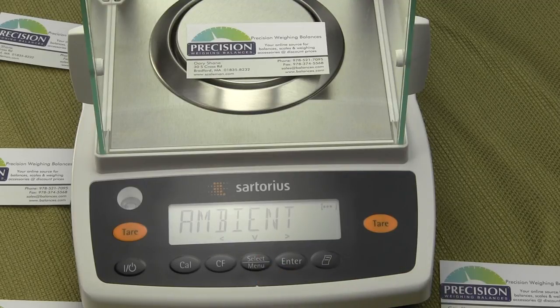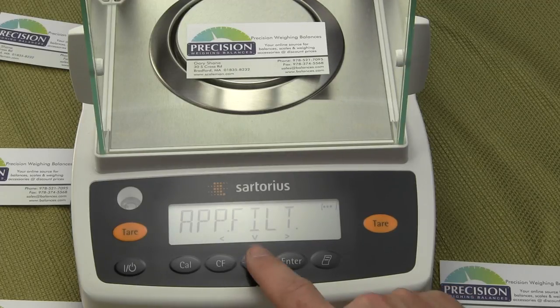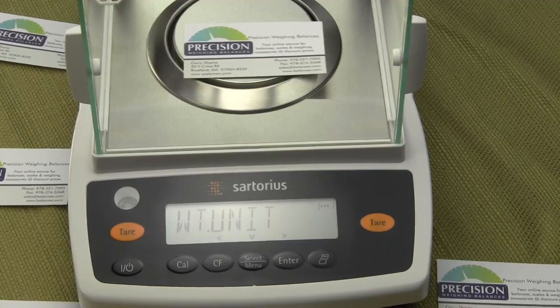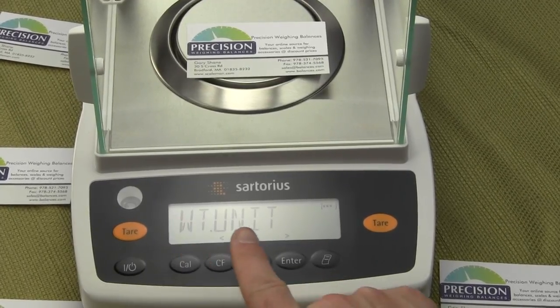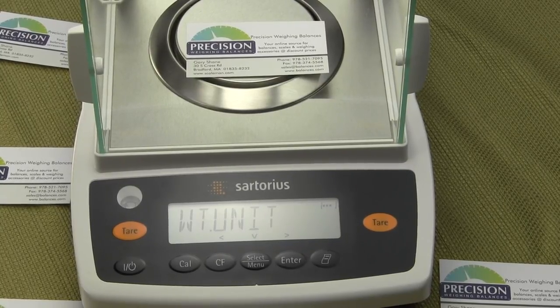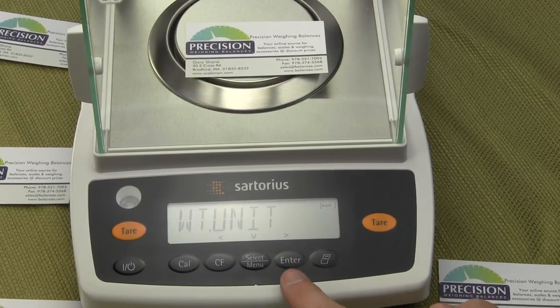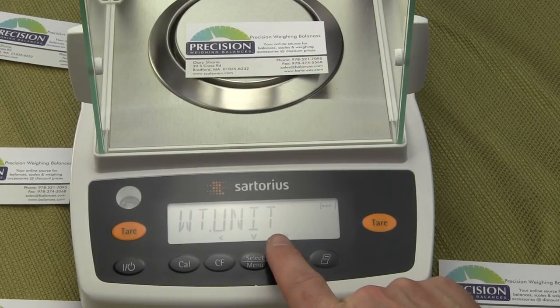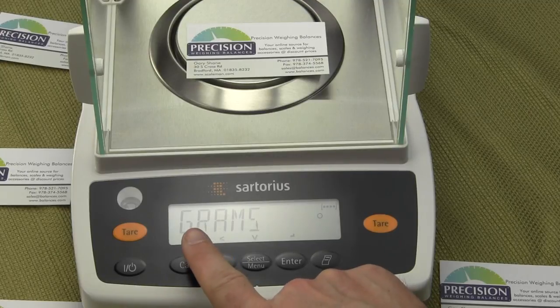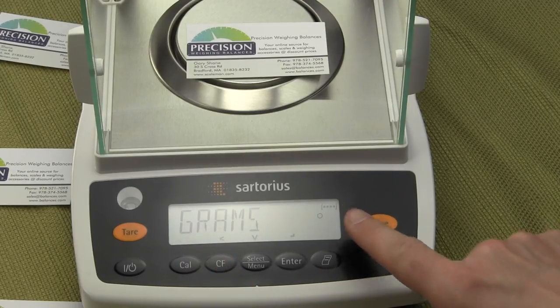At that point, press the select menu button five times. The fifth time you're going to see 'unit weight.' We now need to go into this menu and change the configuration, so press the enter key. You'll notice it states 'grams' and there's a circle next to it. That circle designates that the balance is currently set to grams.